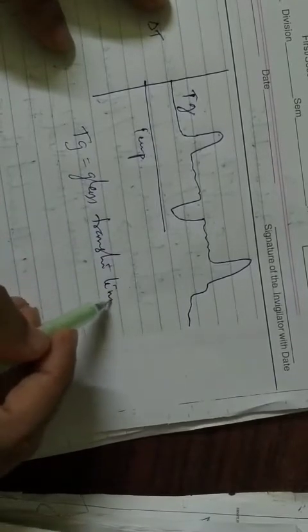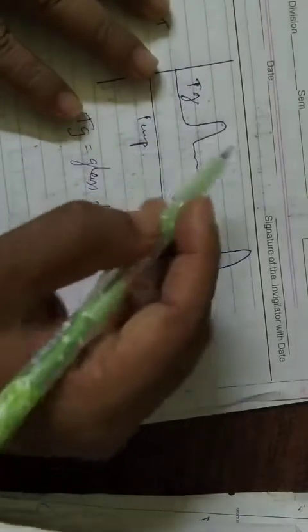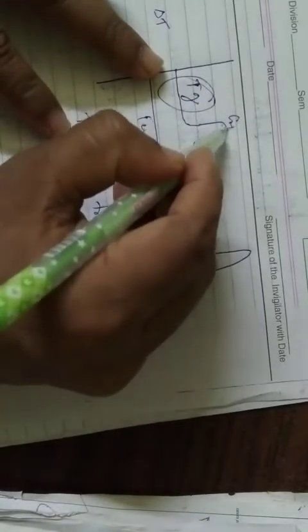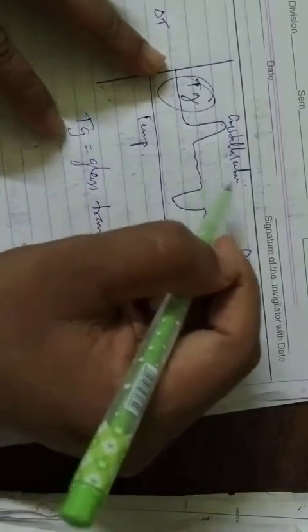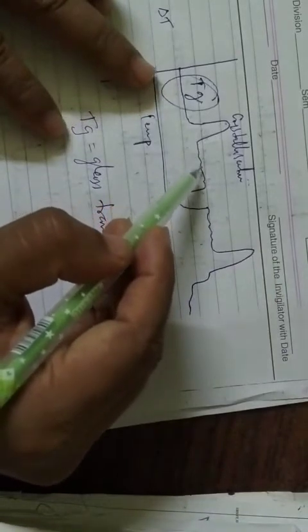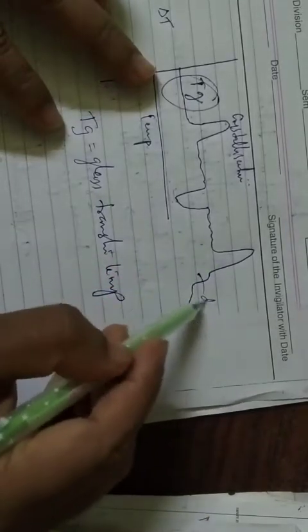Finally it comes downward here. So this we call Tg, the glass transition temperature, because if we are using a polymeric material, this is how DTA helps. The first peak we get here is crystallization. The polymeric form crystallizes as we increase the temperature, and slowly you can see a small change here, and again a negative peak. Lastly, this is decomposition, where the product is decomposed.